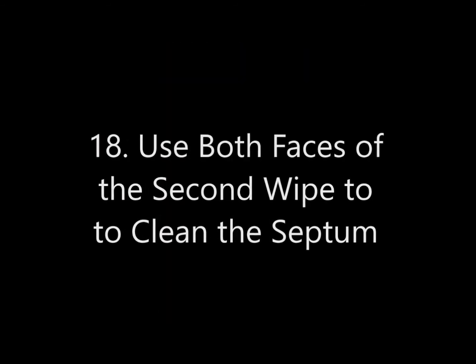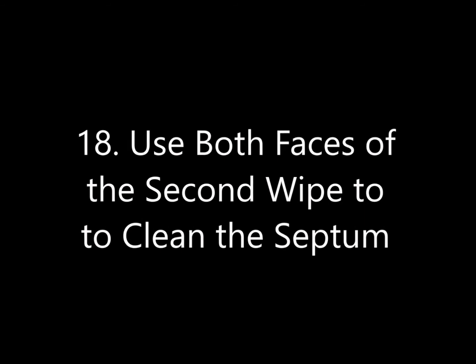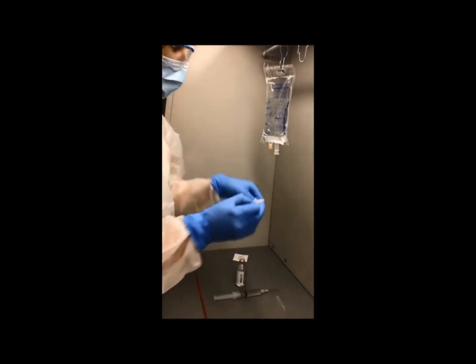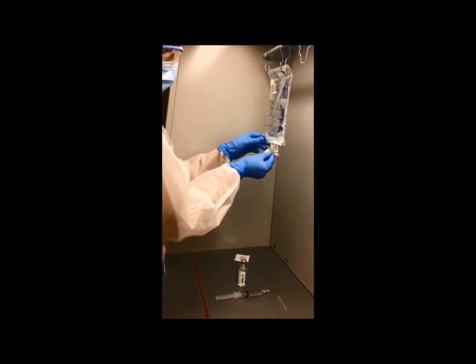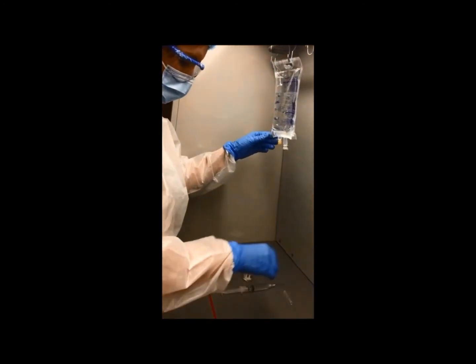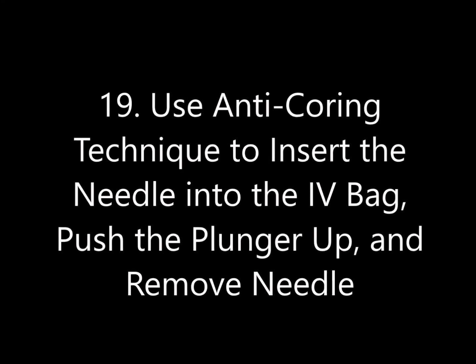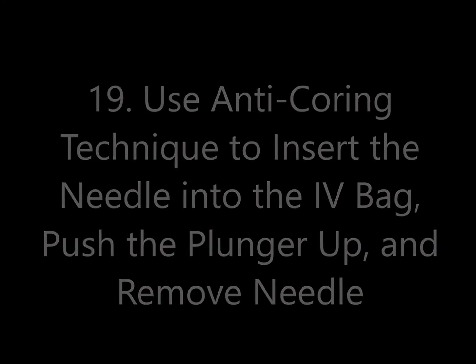Step 18: Use both faces of the second wipe to clean the septum. Step 19: Use the anti-coring technique to insert the needle into the IV bag, then push the plunger up and remove the needle.